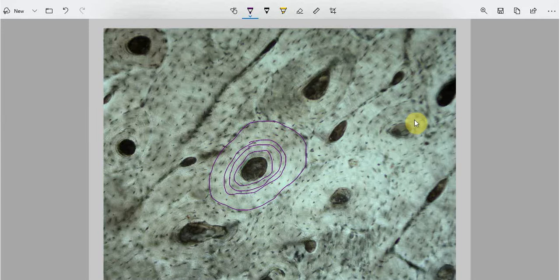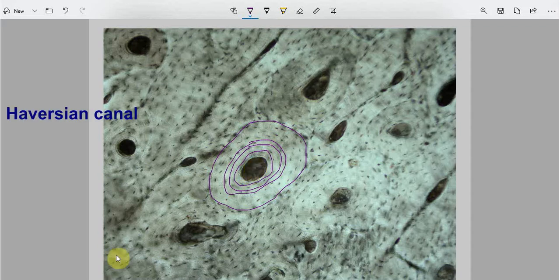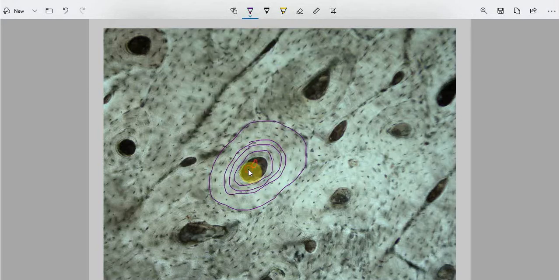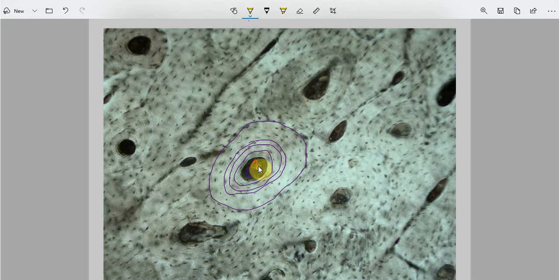In the center of this osteon — in the center of these concentric lamellae — there is a canal known as the Haversian canal. In the living bone, this canal is lined by cells, and in addition to the cells, each canal contains a capillary, a vein, and a nerve. So it contains a neurovascular bundle.